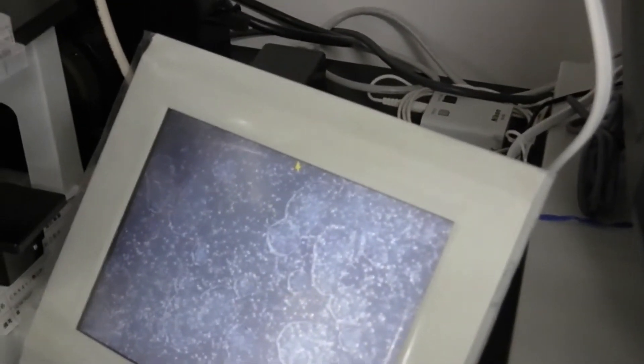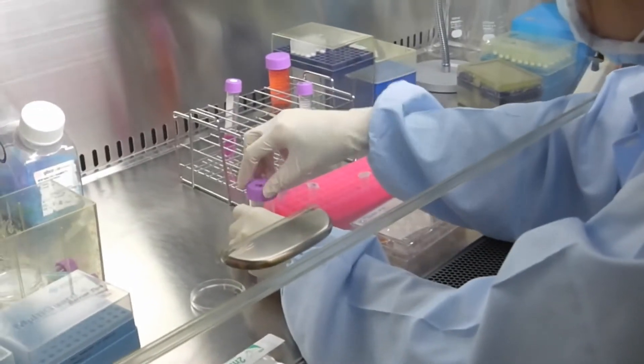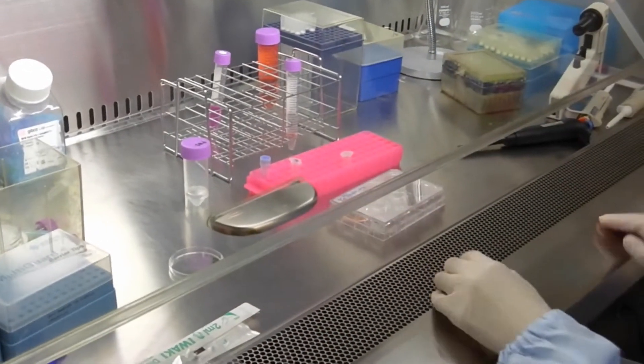Take out the culture plate on which the human iPS cells have been cultured from the incubator, check the cell growth under a microscope, and transport the cells to a safety cabinet.